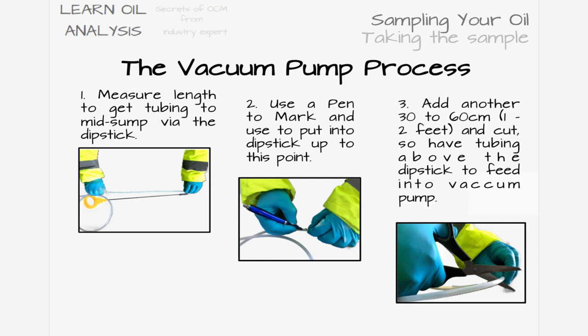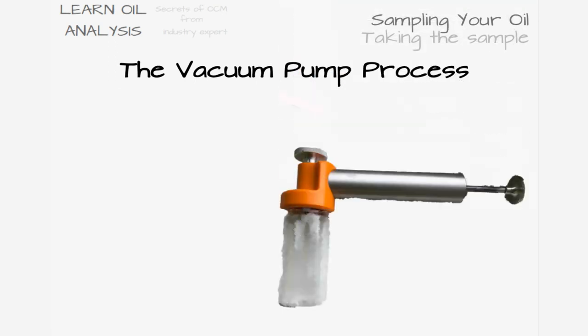Once cut, unscrew your bottle and screw it to the pump. Loosen the top seal on the pump and push the tubing through to just above the fill line. Tighten the seal on the top of the pump, then pull the handle a few times to create a vacuum drawing the oil sample into the container.